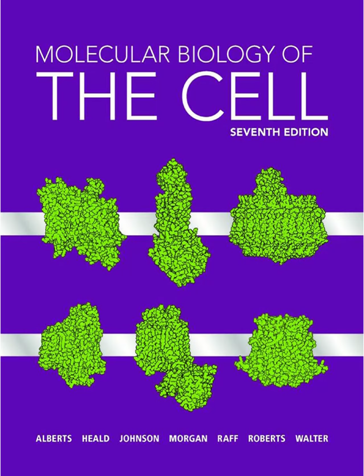Like when you overlay two window screens and see bigger patterns. Exactly like that. You take multiple images with the illumination pattern rotated and shifted, and then a computer algorithm analyzes how the sample generated those moire patterns to computationally reconstruct a super-resolved image. Clever. And it works with standard dyes. Mostly, yes. It's quite versatile, can do 3D, and works with many standard fluorescent labels. What other ways are there to get super resolution?